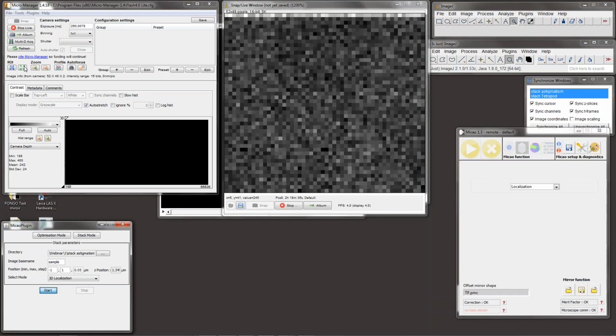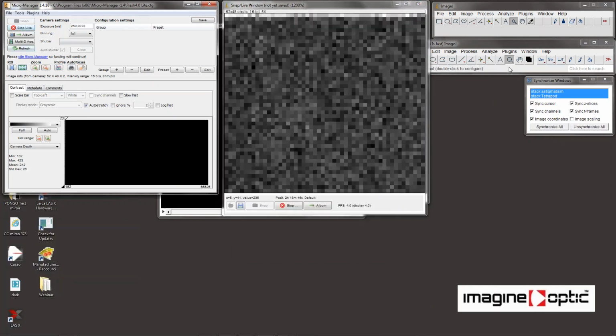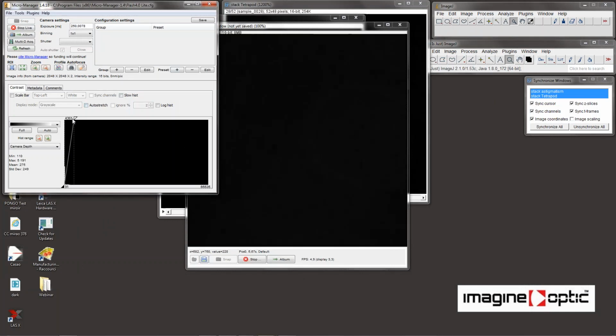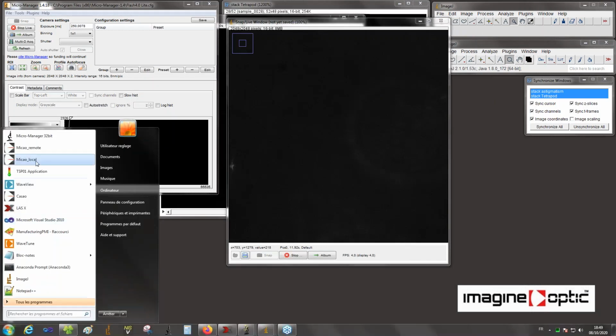Now, if you want to extend that to other techniques like spinning disk microscopy, where you are more likely to do a Z-stack over 30 or 40 microns, or even 100 microns, then yes, you will run the optimization in one plane. There are two options. You can run optimization in the first plane and run the same optimization in the last plane, pretty much what Odorus is doing right now.